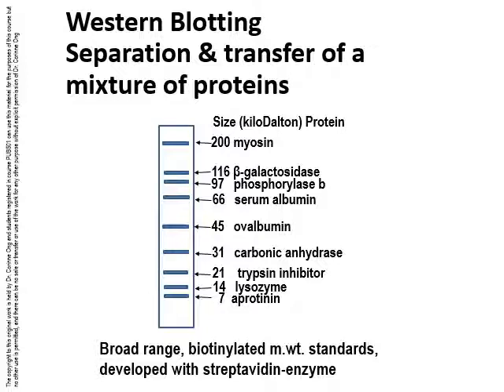This is very convenient for timing coffee breaks, as it is important not to leave your SDS-PAGE gel running too long, since the lowest molecular weight proteins can drop off the bottom of the gel, and once again you lose them forever, which tends to be an unmitigated disaster, especially if you are particularly interested in the lower molecular weight proteins, and you spend a whole year or more growing and purifying viruses to get their proteins.